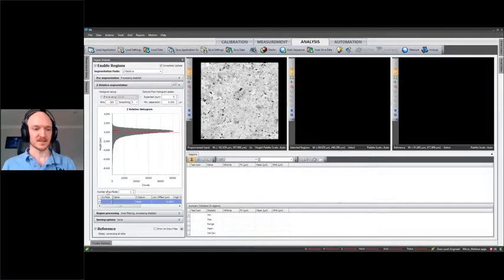Okay, so I'll go down to my surface selection here, and we can scroll over, and there's a few things that we'll work with. The first one to note is the Z datum. Now this is going to be the datum that we use to apply our offsets. So our offsets will be relative to this. There's different options for this. In this case, we'll just choose the mean of the map.